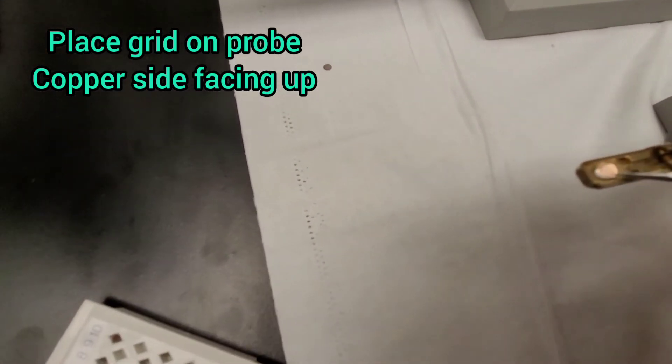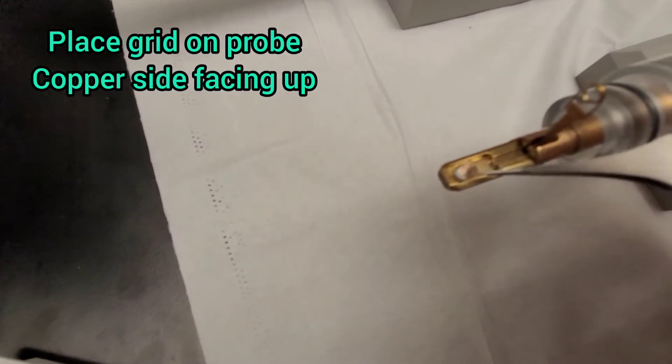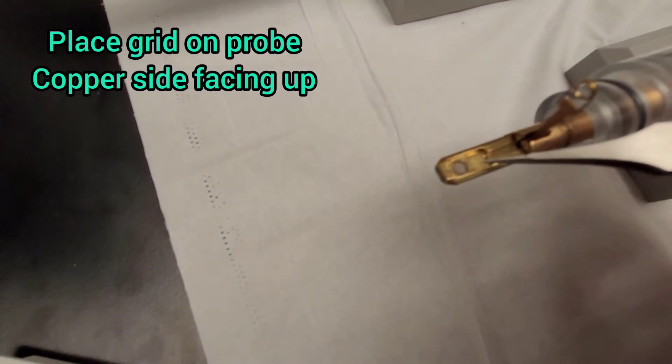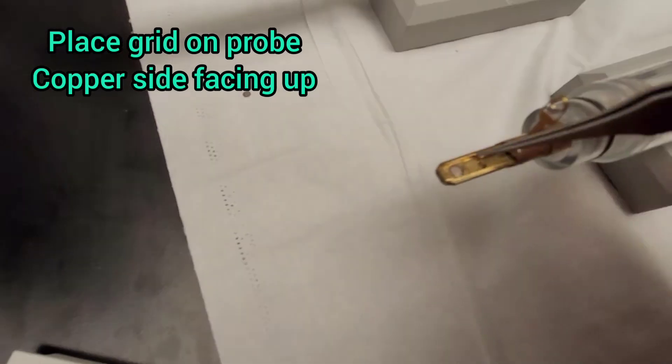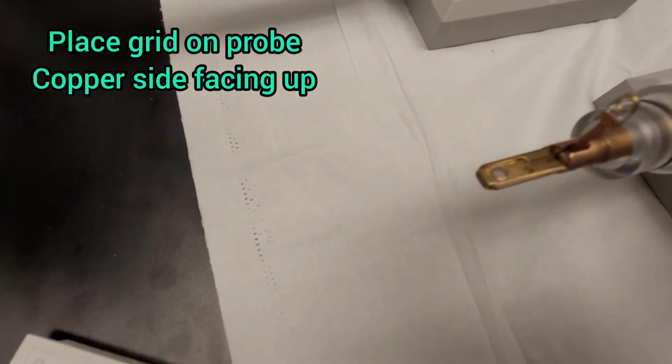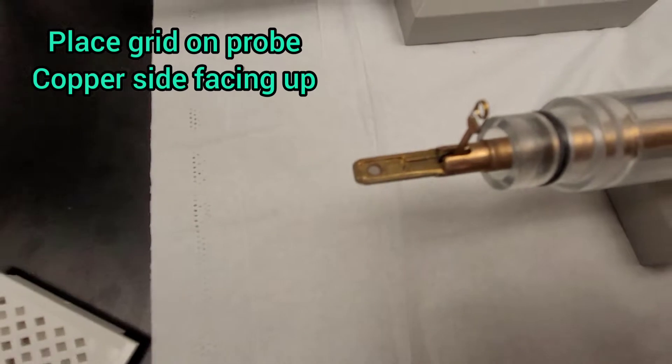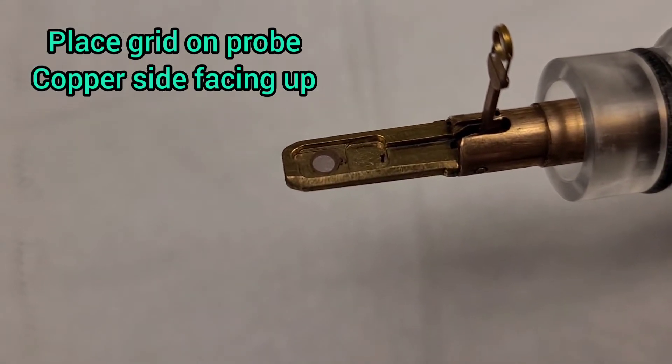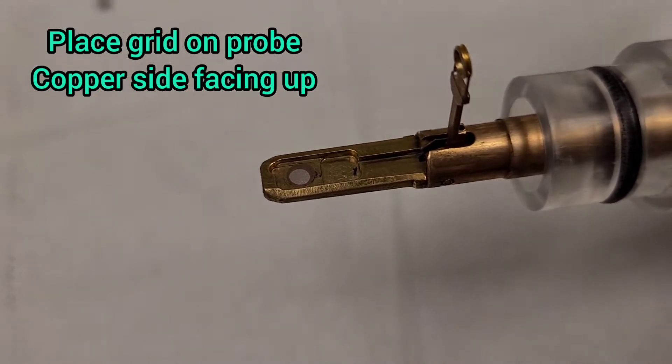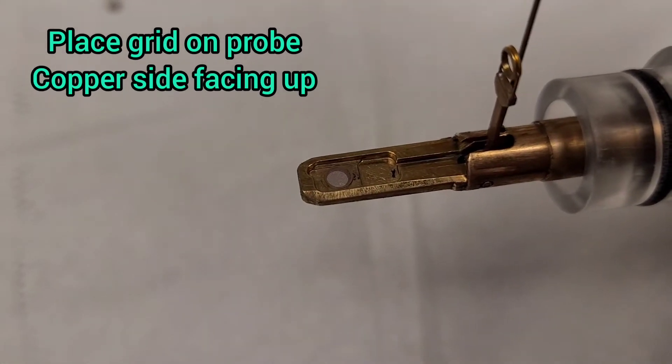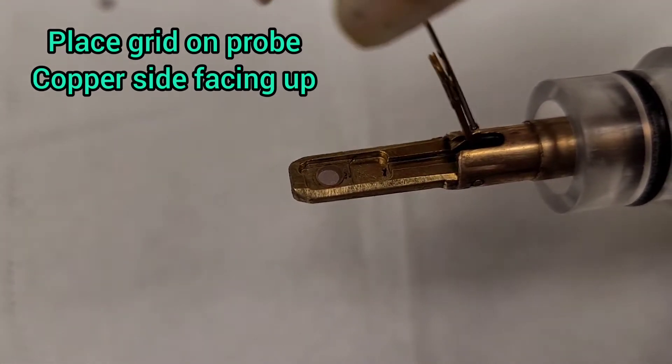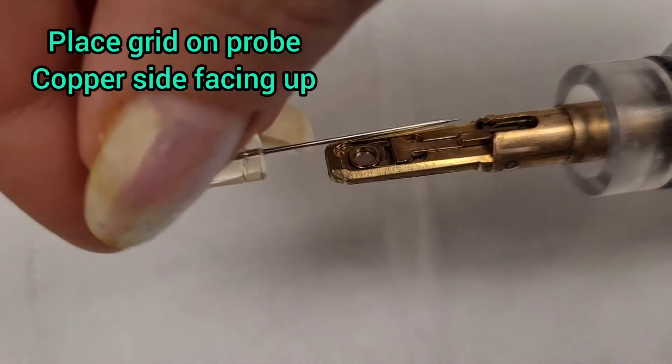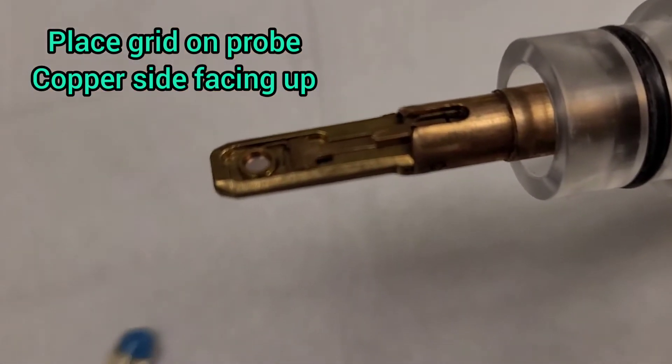You want to place it on this probe with the shiny copper side facing up and carbon side facing down. Then you use this small tool to bring this down so you secure it in place.